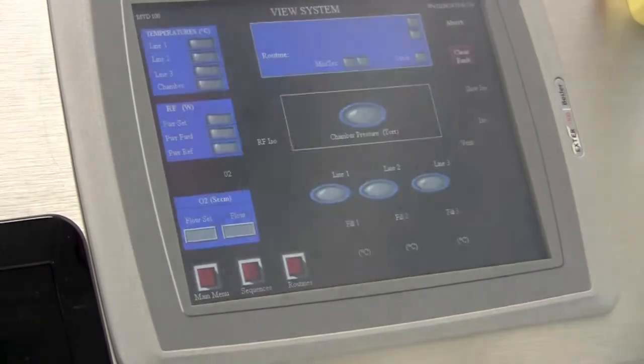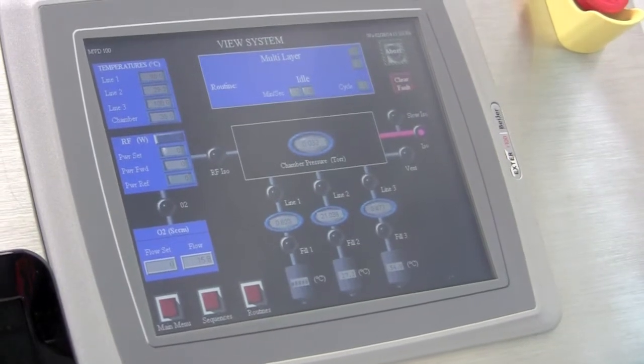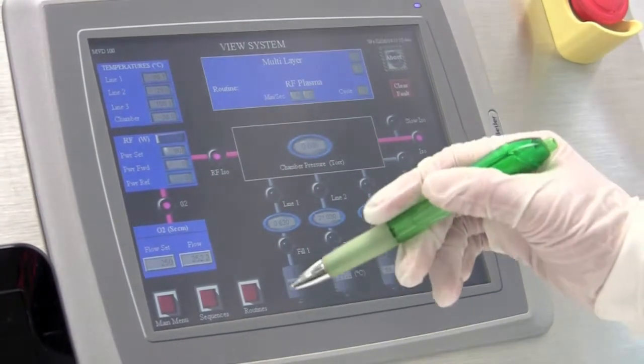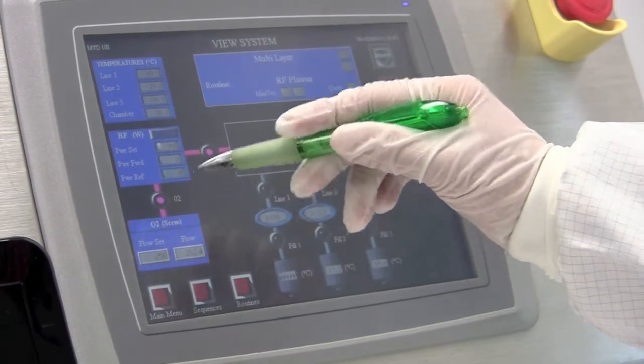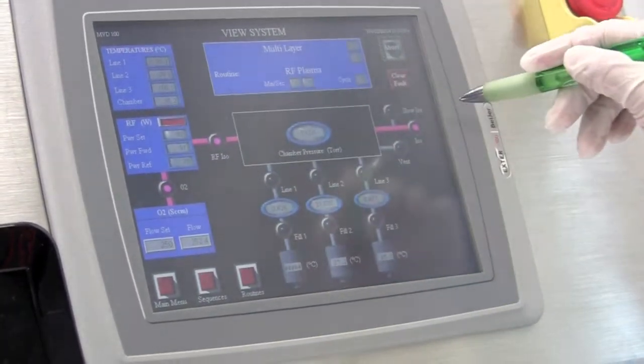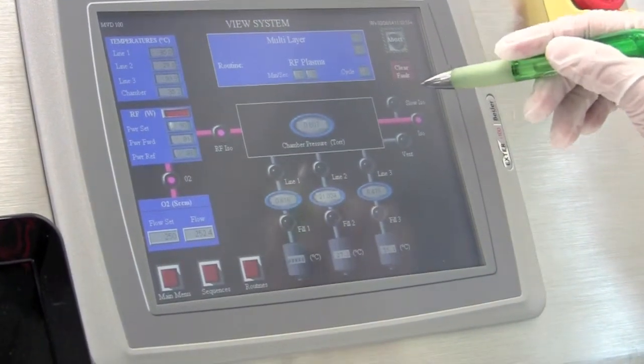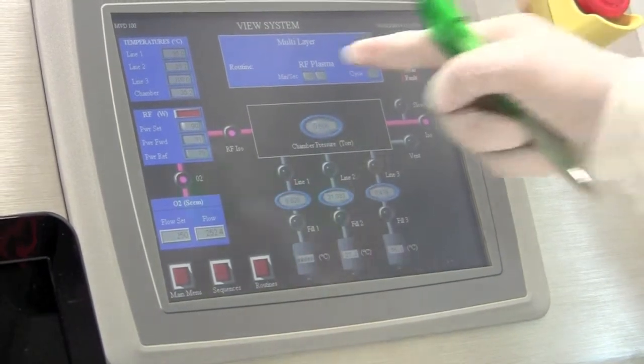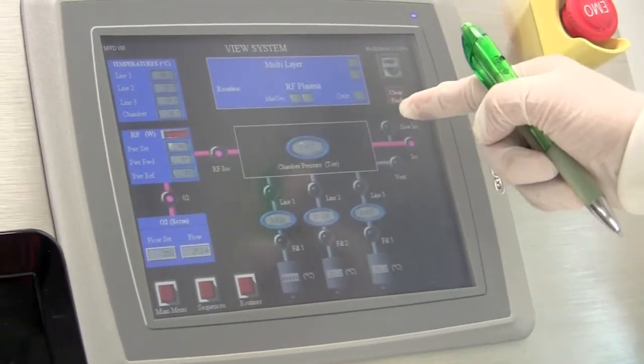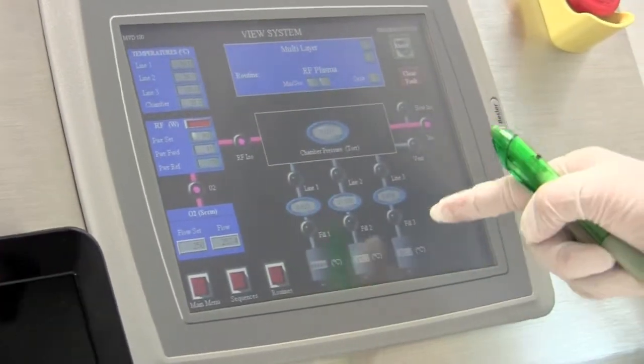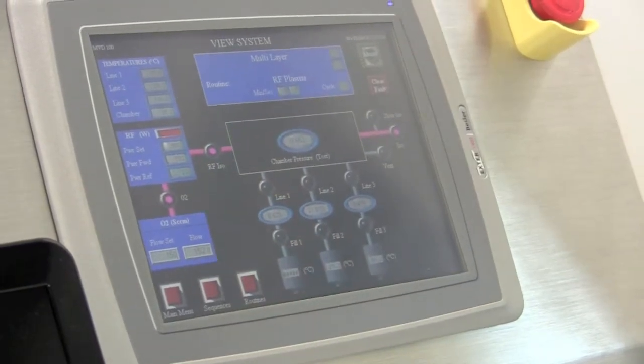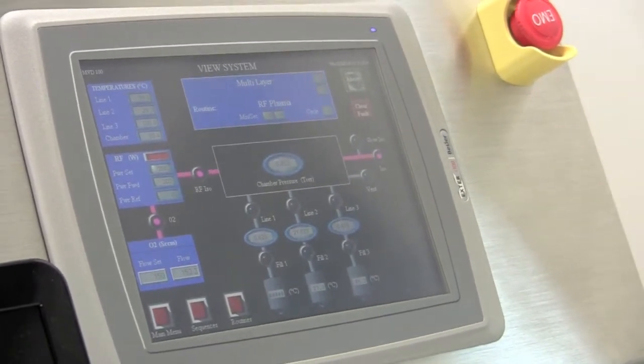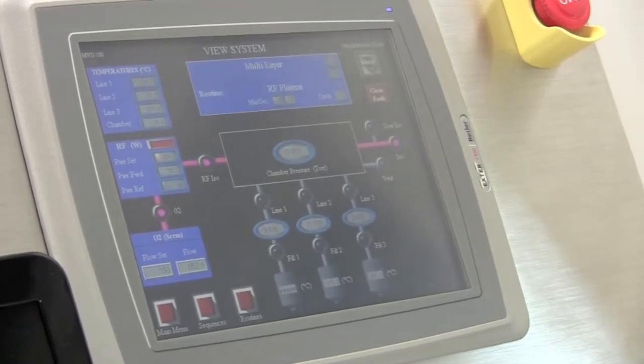So the recipe we loaded is a six layer recipe. It will take about four hours to finish it. The process is about like this. First, the O2 plasma will treat the surface. By doing this, the precursor can bind to the sample. So then after the O2 plasma is done, then the water vapor will be injected for about two minutes. Then the precursors will be injected into the chamber for 30 minutes. Each cycle will be about 35 minutes, so the six cycles will take roughly four hours.